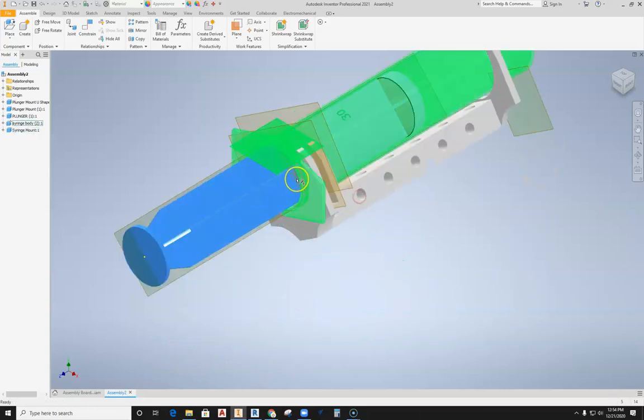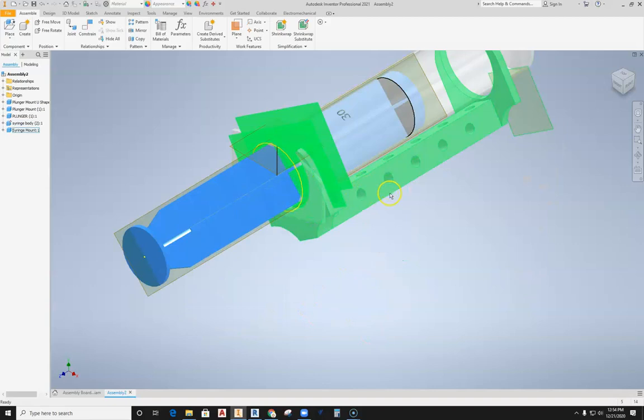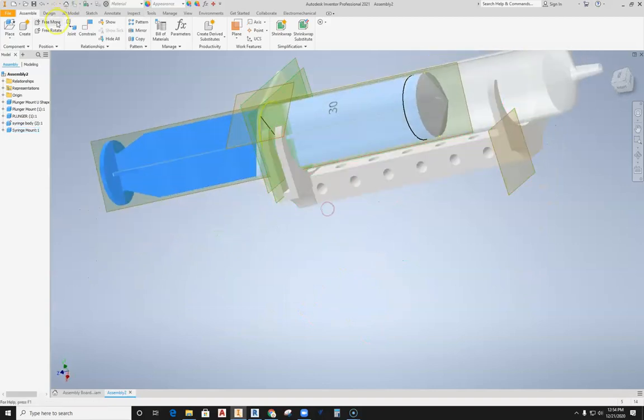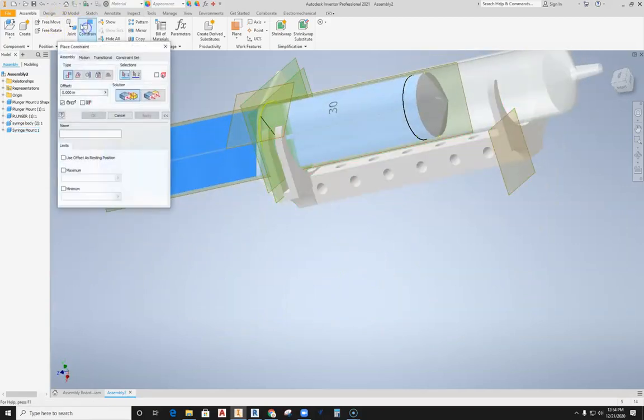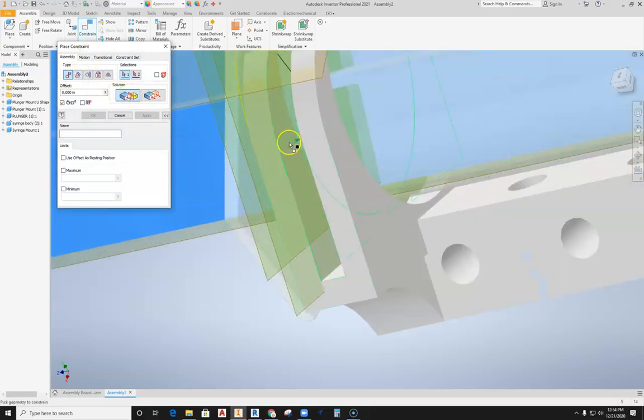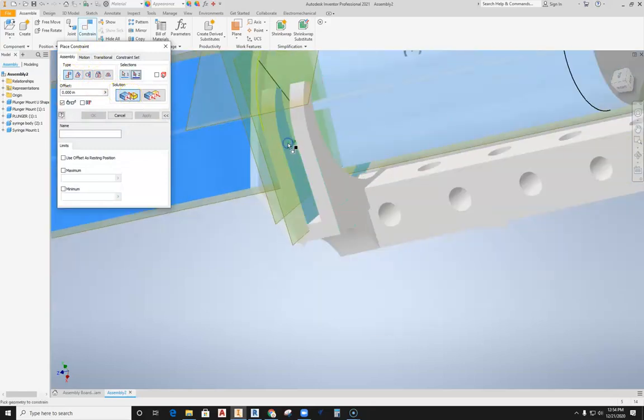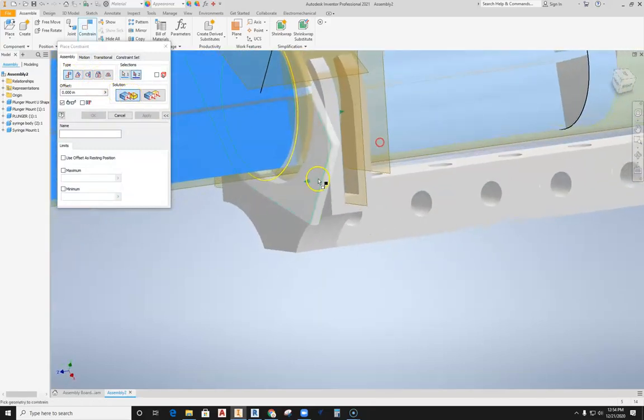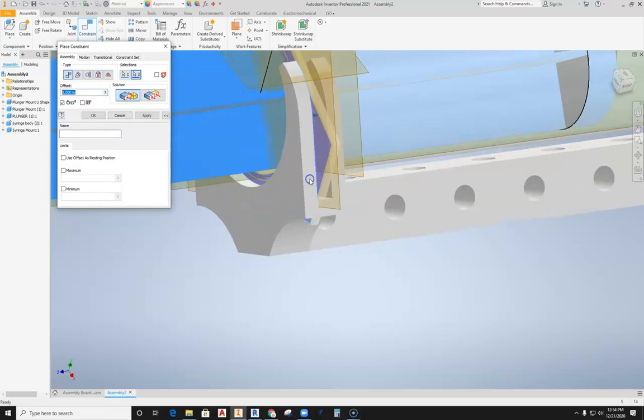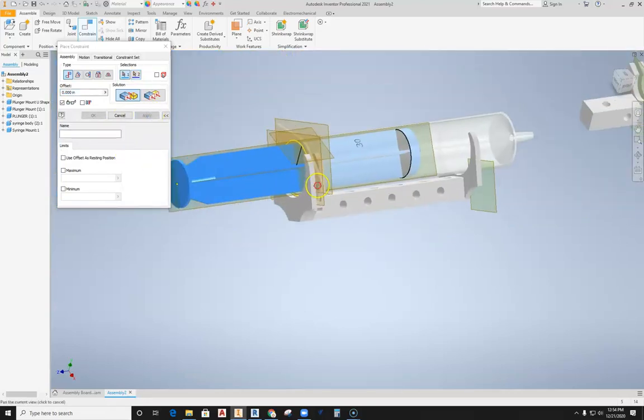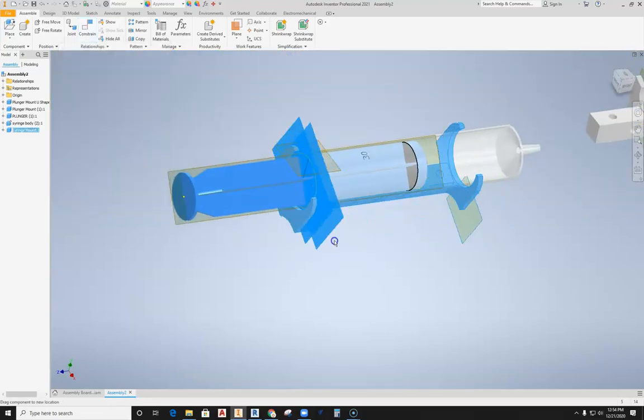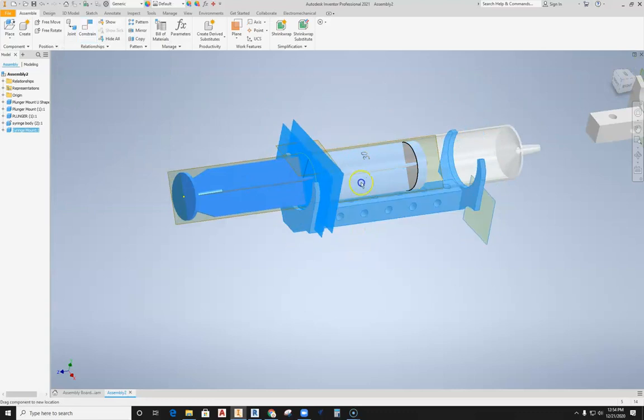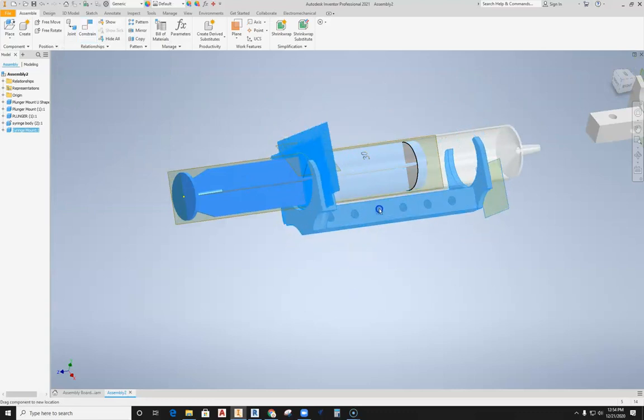But we're going to go ahead and fix that next position. We'll hit constrain, I'm going to use a positional mate, and I'm going to select that surface inside there because what happens is it then touches that surface. I'm going to hit apply. Now this will still spin around, which obviously isn't right either.